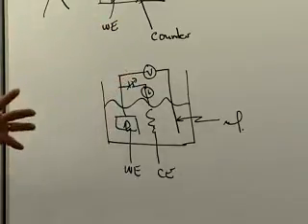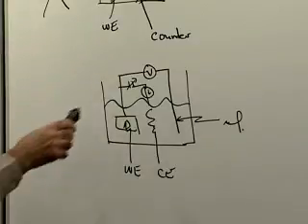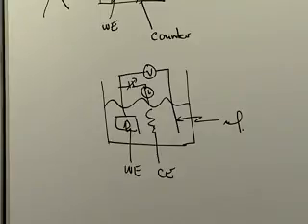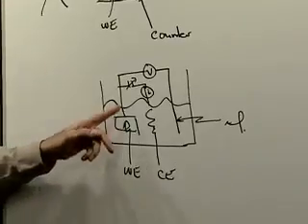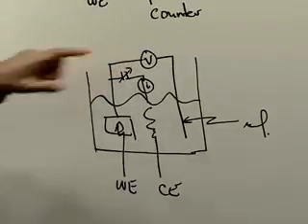Okay, so this is a safety consideration. You're sitting there now with a real-life potentiostat that does not have an undergraduate mounted on the inside, and somehow it's doing exactly the same thing, developing a feedback loop where it monitors the voltage between the working and reference electrodes and then changes the output of its power supply between the working and the counter electrode. So you're sitting there saying, oh, look, it's at 2 volts versus my reference electrode. I can't be hurt because it's 2 volts, and what could 2 volts do to me? Okay. And what you're not realizing is that if there's enough resistance in this circuit and if the kinetics are sluggish enough and things like that, that power supply might be putting out 100 volts between the working and counter electrode when you read 2 volts on this meter.